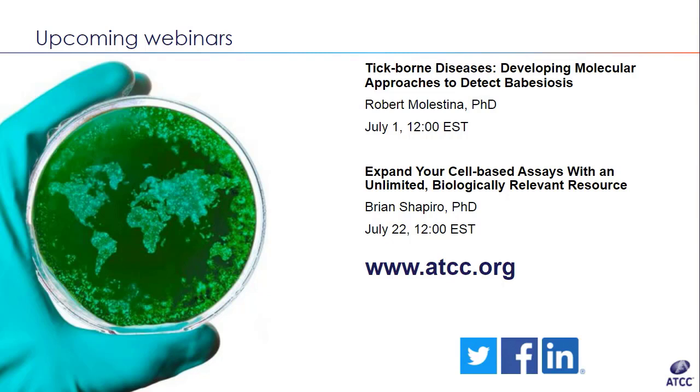So the DQ is the suffix that we put on the molecular version of the live culture. So that's DNA in a quantitative format. And then the SD is a synthetic DNA. We didn't want to confuse everyone by adding RNA in there, so they're both DQ or SD. And then for the SD products, there's no base culture associated with that item number, just to make sure that we don't confuse people, because there are some synthetic products that are covered by the United States Commerce Control List that can't ship internationally.